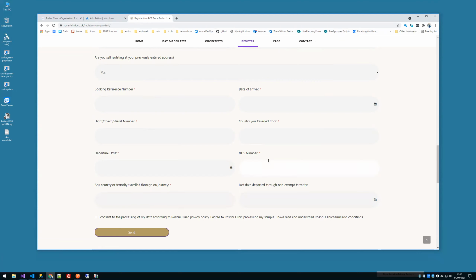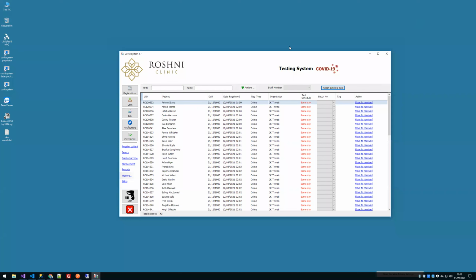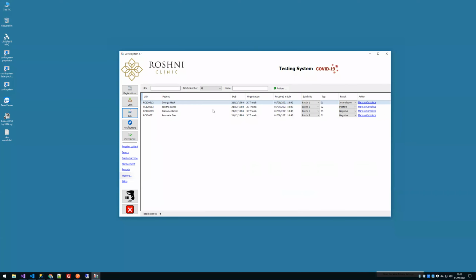Okay, so I'm going to have to review all this with the lab manager. Would we be able to meet again tomorrow? It doesn't have to be with you, but anybody that could basically go over it with the lab manager, more on the lab part of it, the testing and all that stuff. Yeah, sure. You've got this recorded, haven't you? I don't want to go through all that again, but specifically this area where it's the lab, where all the tests are, and you're assigning batch numbers and results. These are the key fields for the lab, and I can go through that with you, not a problem.